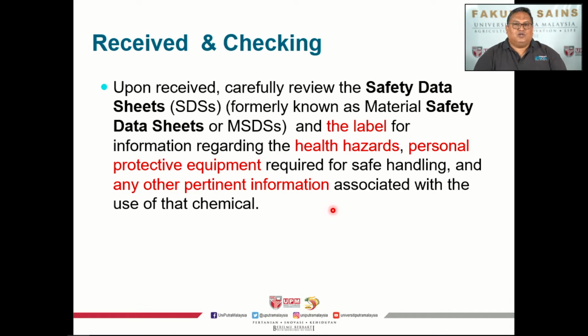Okay, so everything went smoothly. You have purchased your chemicals. Now the company is going to deliver the chemicals. All right, so the chemicals have arrived at the faculty. Now it's upon yourself to actually check.